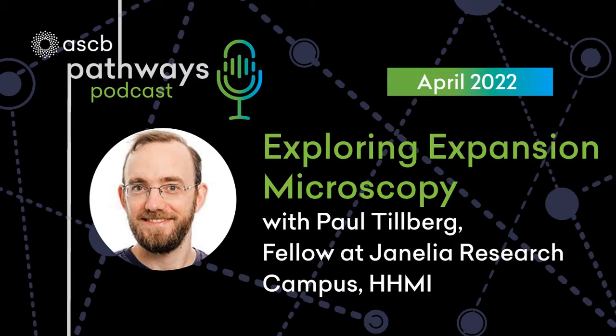What types of tissues or cells is expansion microscopy most well suited for? So brain is the easiest that we've seen. Brain tissue just tends to be very soft. You can also do cultured cells, of course, but it's with thicker tissue slices that you really get a differential benefit compared to other super resolution techniques. So I'll focus more on those thicker tissue slices. Brain is very soft, so it's very easy to disrupt it fully and get uniform expansion.